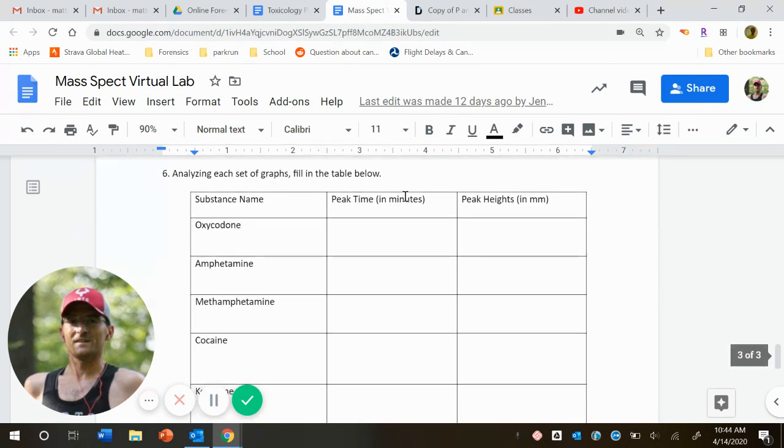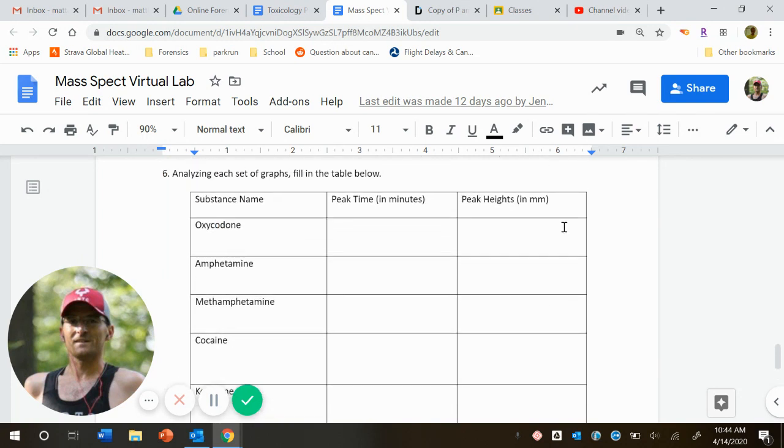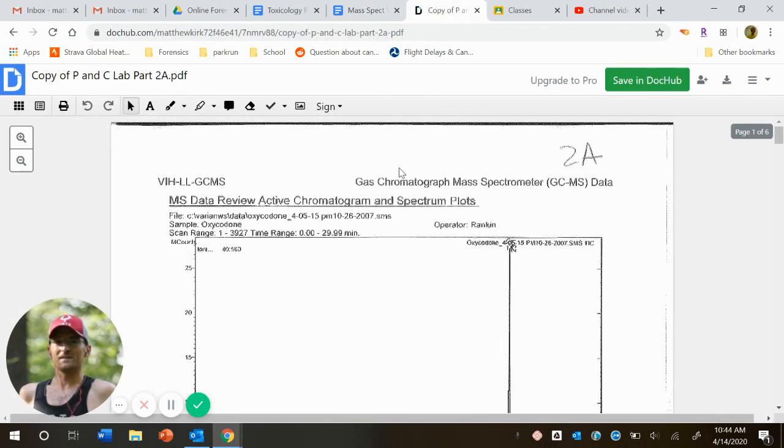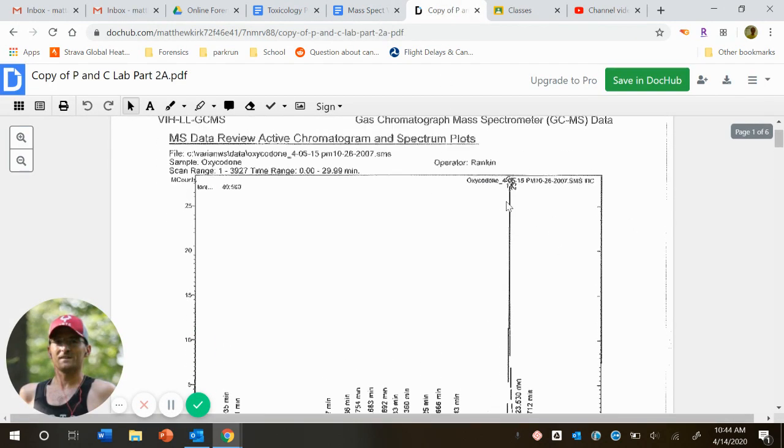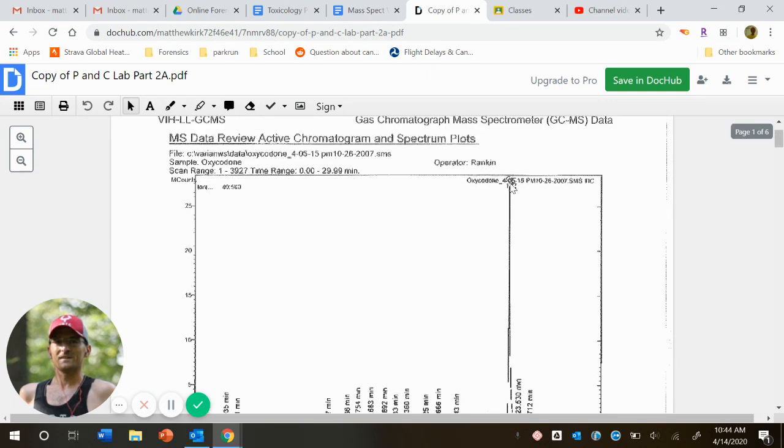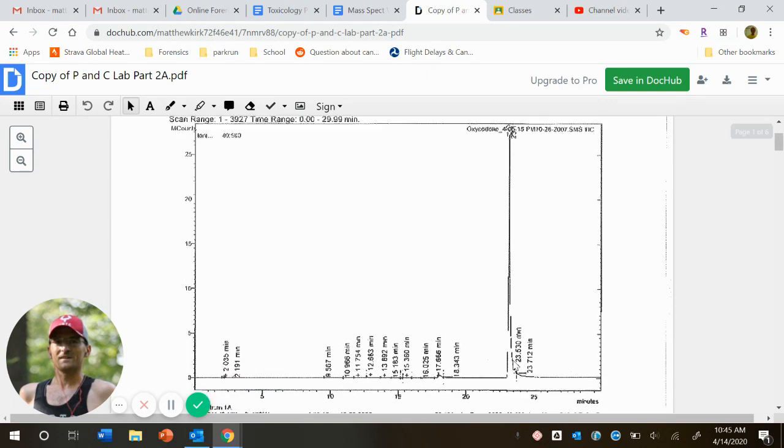So we have our five different knowns. So what you should go through is kind of record the most important peaks here. So let me maybe do oxycodone here. So first peak time, that would be my spectrum. And so what I would actually look at is the big peak only for this one.